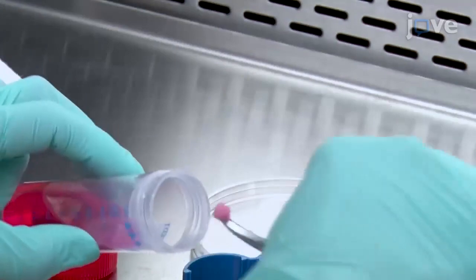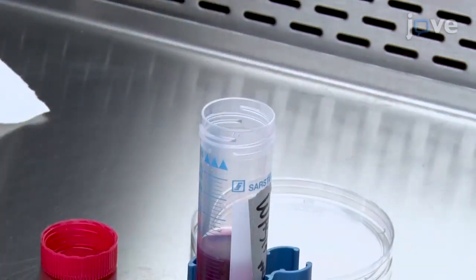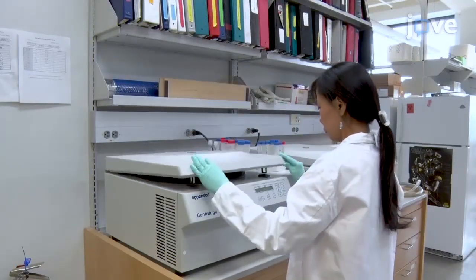Transfer the minced tissues into a new 50 ml tube containing 25 ml of wash medium. Then centrifuge the sample at 500 times G for 15 minutes at 4 degrees Celsius.